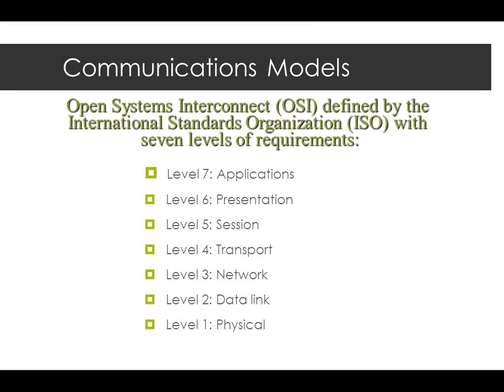Then you have to have the communications models. You mentioned one, HL7. We'll talk a little bit about that. You need to know that there are lots of standards institutes and areas within both government and private sector working on trying to standardize a lot of this. So there's the Open Systems Interconnect, or OSI, which was one of the original standardizations.